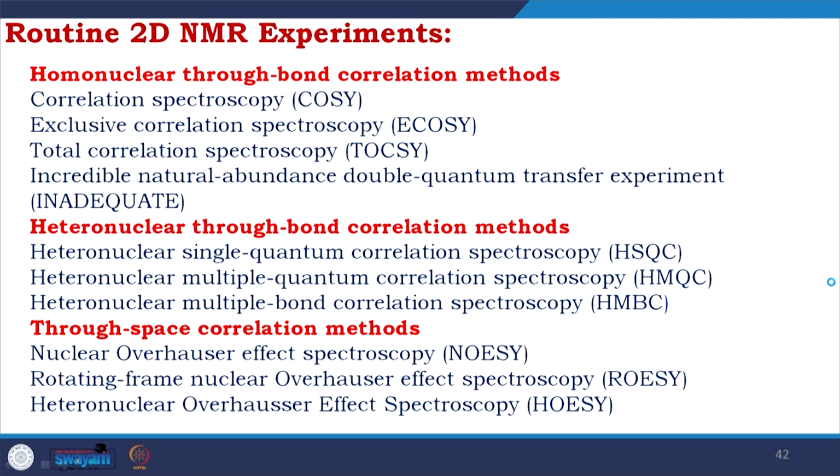In the next class we will discuss all the routine 2D NMR experiments, how they are converted into 3D NMR experiments, and most importantly how 3D NMR experiments help us study proteins.